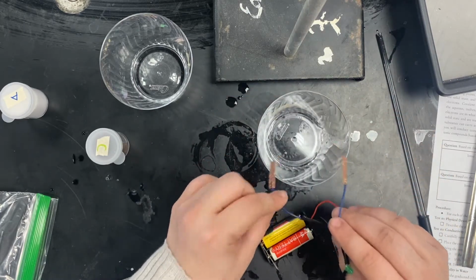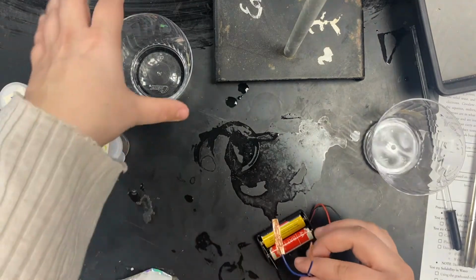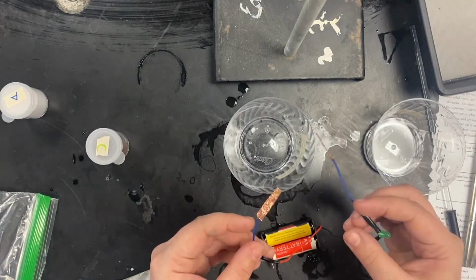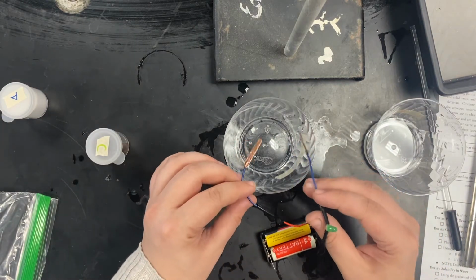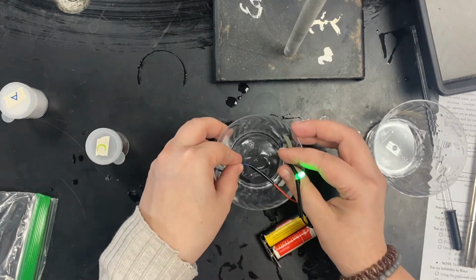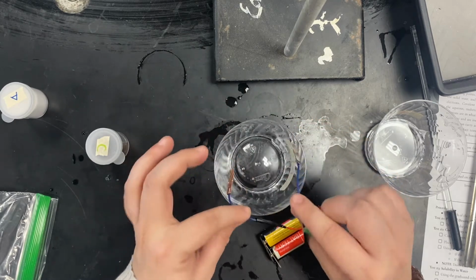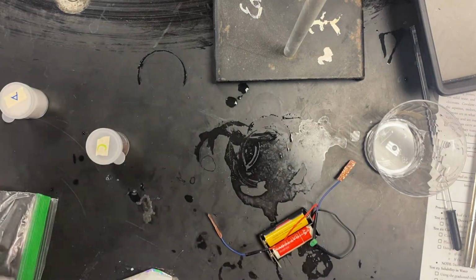Now, when you have water, especially water from the sink, you already have ions in the water that exist naturally. So even though the substance itself might not be a conductor, you may get that dim light bulb. But when you throw it into cup C, you should be able to see a difference in the brightness of the bulb. Bright bulbs are good conductors, dim bulbs are poor conductors. And so that is it for all of your data collection.